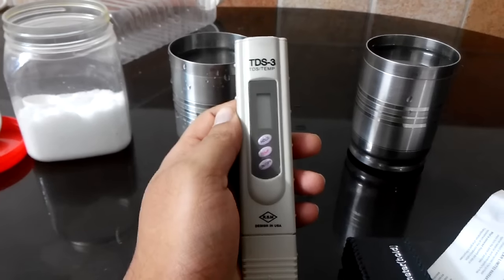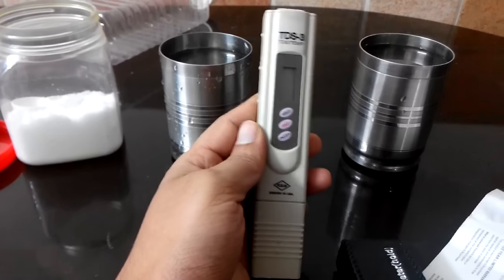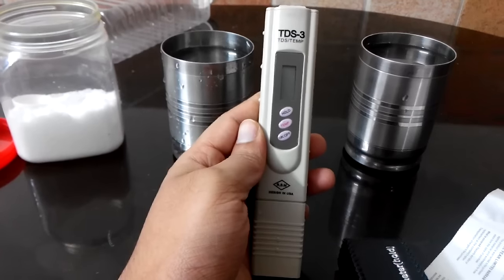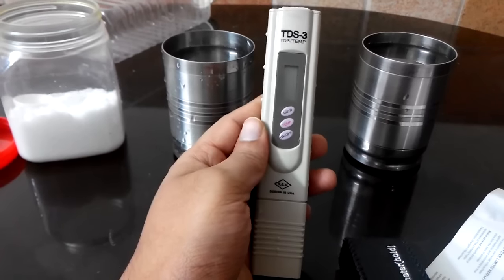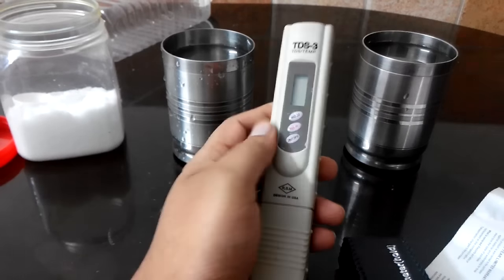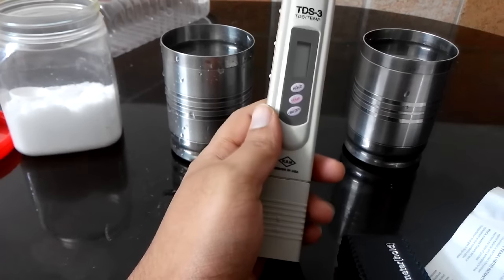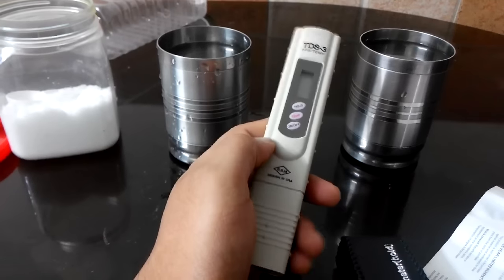Hi guys, this is Yana. Today I will show you how to use this TDS meter. TDS stands for Total Dissolved Solids. It's basically the hardness of the water. You can use this device to measure the hardness or TDS of your drinking water.